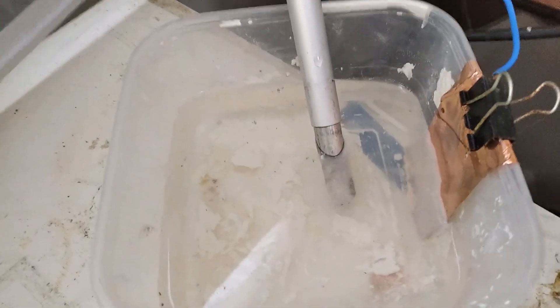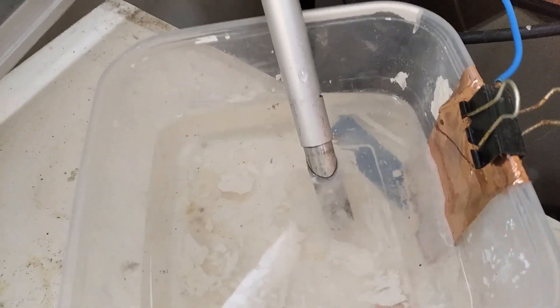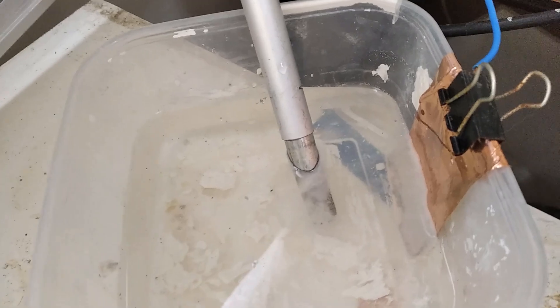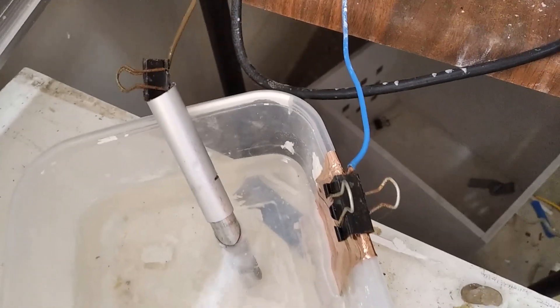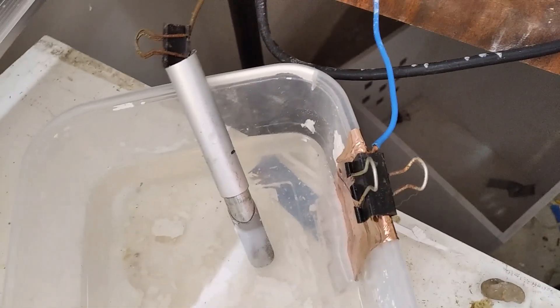The goal is to make iron filings on the cathode — essentially trying to electroplate steel or iron. This is possible and has been done before, but never without using a membrane.